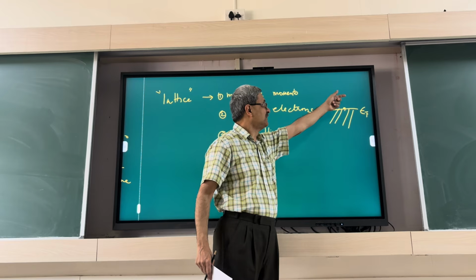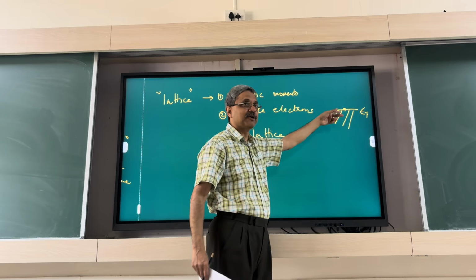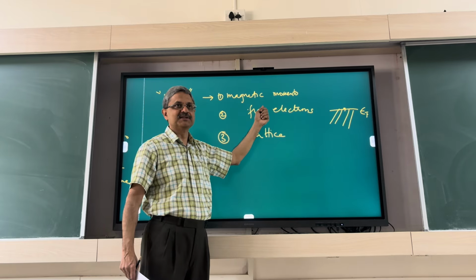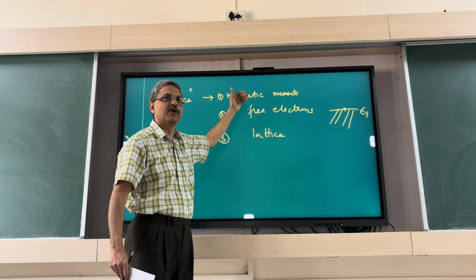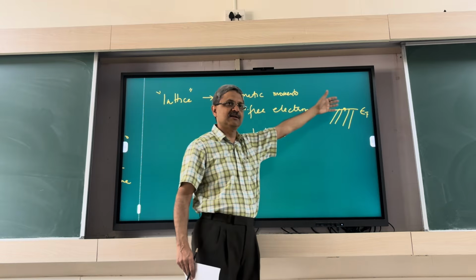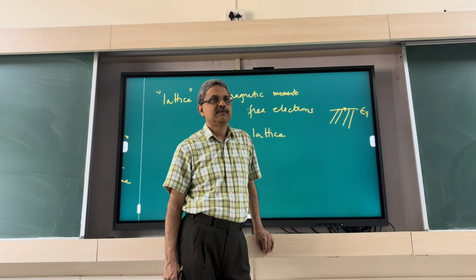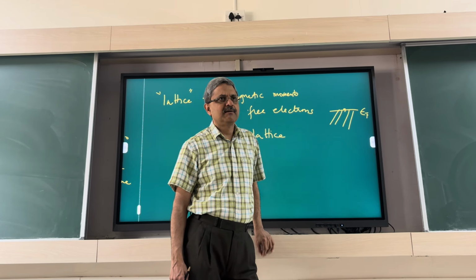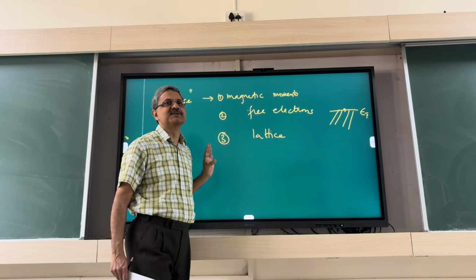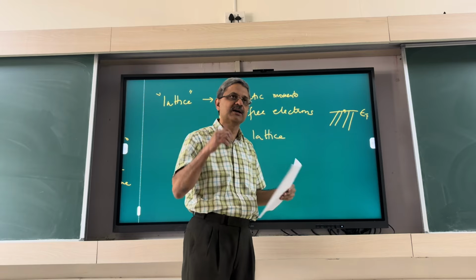Fluctuations in the lattice here, the spin system or the electrons, give rise to a dissipation in the nuclear system. So you need loss of energy in the nuclear system, which is taken up by the lattice. Can we say it's a relaxation between two systems? The word is relaxation because the nuclear system is coming back to the ground state from some excited state you created because of the RF field.